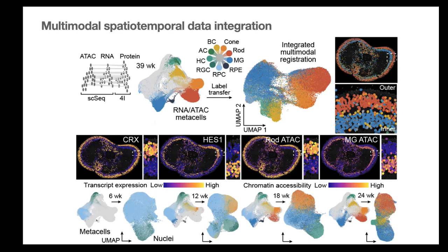For the actual integration we used Seurat, a standard processing pipeline in the single cell world, where by overlapping features for the protein and the RNA you build KNN graphs, and by finding mutual neighbors you transfer labels over. This worked pretty well in our case.